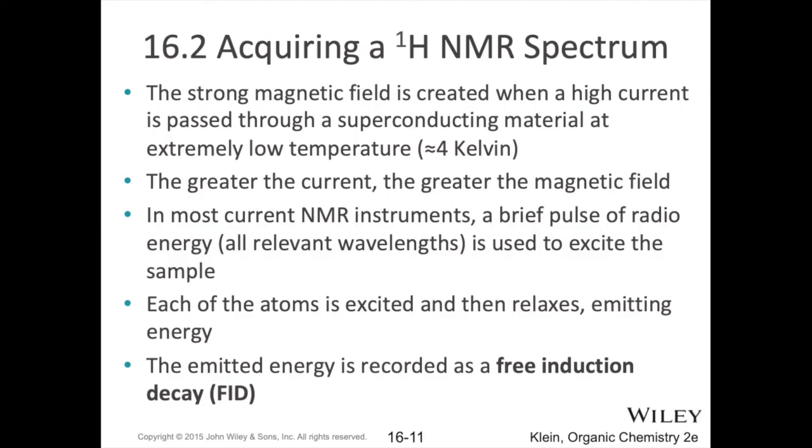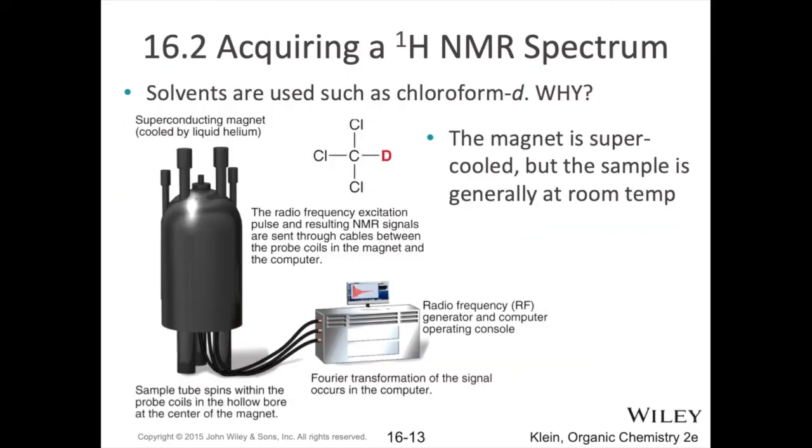So how does the NMR machine itself actually work? How do we collect this data from our sample? To understand this, let me skip ahead a couple of slides and show you a picture of what the setup looks like. Here we have our giant magnet. Our sample is injected in through the top over here, and it's gently lowered into the heart of this magnet.